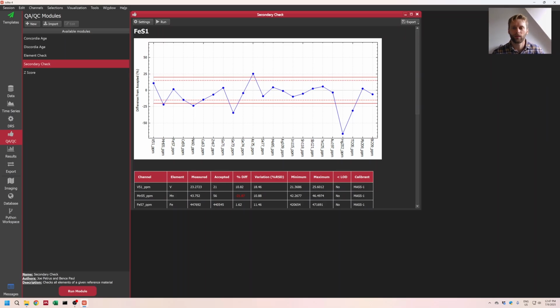If you're sending it to me, I'll probably want to see your entire Iolite file. So just send me a link with your whole Iolite file, and then I'll be able to see everything. That will be the most useful.